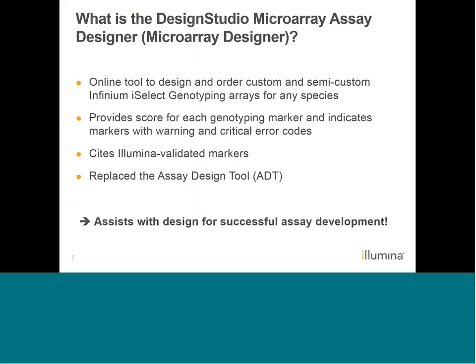It provides a score for each target submitted, and it indicates markers with warning and critical error codes, and we'll get into that in more detail. It also cites Illumina validated markers, which is really nice to know that this marker has been designed and validated. And some of you may know that the Microarray Designer replaced what was the assay design tool, and this is really a streamlined tool now.